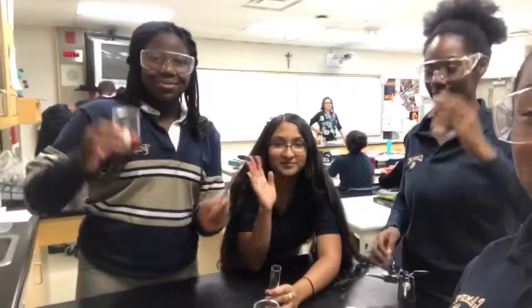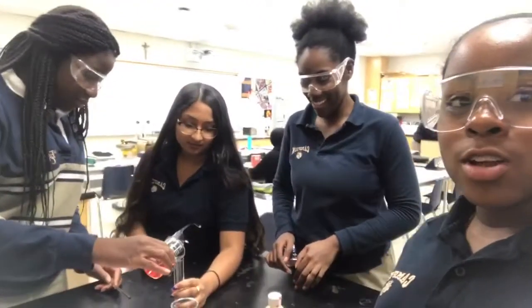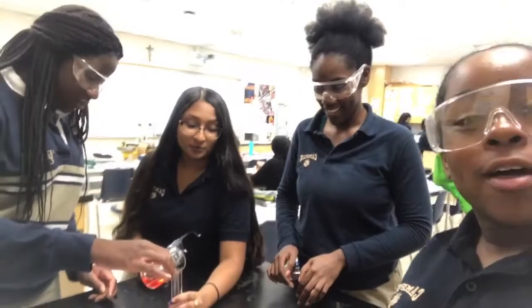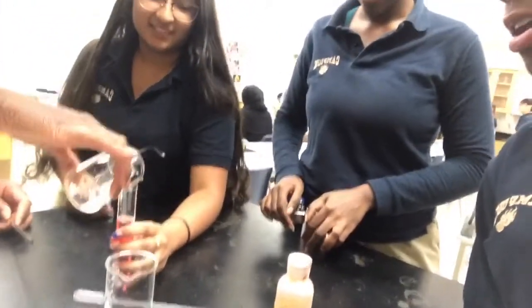Guys, we're in another science vlog today. Hi everyone, say hi. We're making a rainbow. A whole rainbow. Are you excited? I am. Monisha, you probably should put your hair up in the lab. But yeah, we're doing a whole rainbow. So right now we're getting the red part of it done. That's HCl, universal indicator. And we'll come back with the rest of it in just a second.